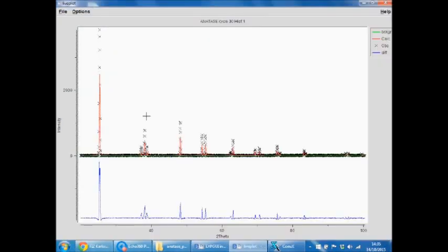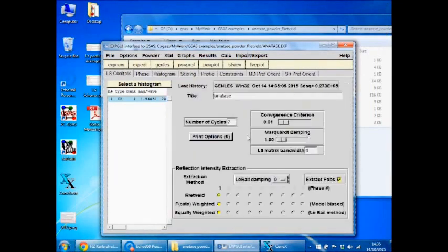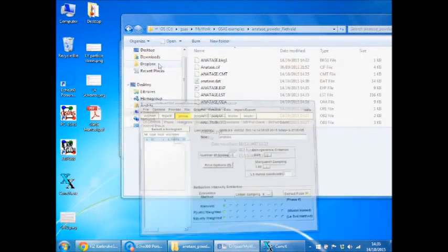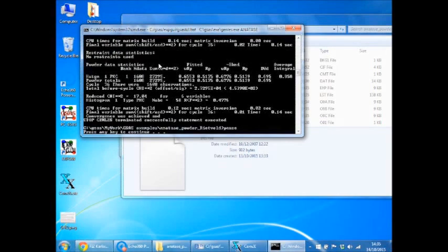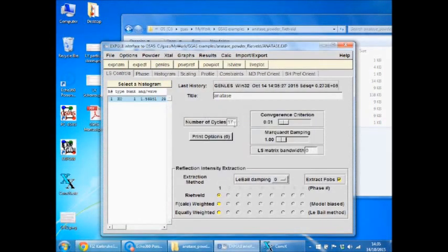So we're getting much closer. It was just the scale factor that was a problem. So I'm just going to keep going. I'm going to increase this number just so we can get the scale factor in the correct place. Well, it's not really changing much now. There are other things that I need to change.